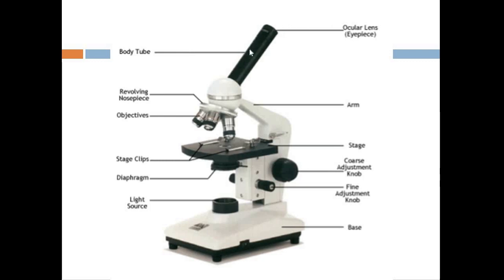So when we look through the first lens and the second lens, there's a point in space and time. Now it might be where my mouse cursor is now, which means the stage will be too high, and that is why it looks blurry. So if we then move the stage down, we'll focus on this exact place in space. We also have this diaphragm underneath, referred to as a condenser, which is like a little clip here, and you turn it, and this will condense or focus the light into different parts when you look under the microscope, and it essentially allows it to brighten up or darken a specimen by focusing light in a particular area.